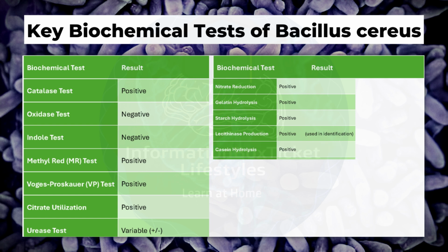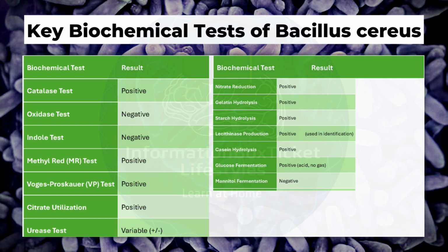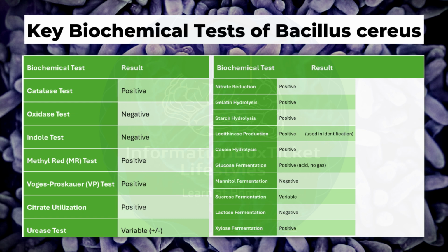Casein hydrolysis, positive. Glucose fermentation, positive. Acid, no gas. Mannitol fermentation, negative. Sucrose fermentation, variable. Lactose fermentation, negative. Xylose fermentation, positive.